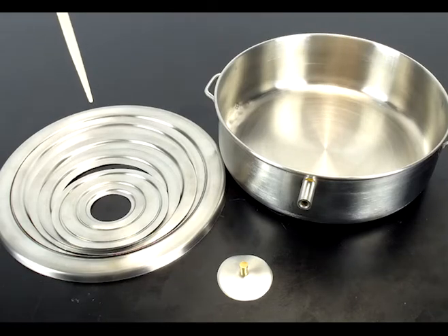The 7 concentric rings allow you to use a variety of flasks while still maintaining stability without it tipping over.